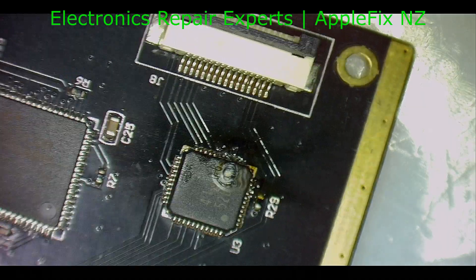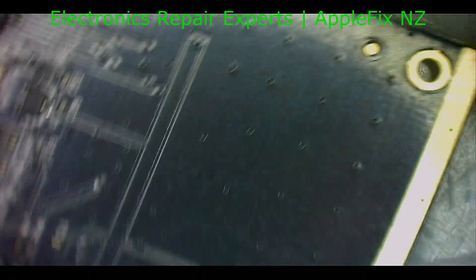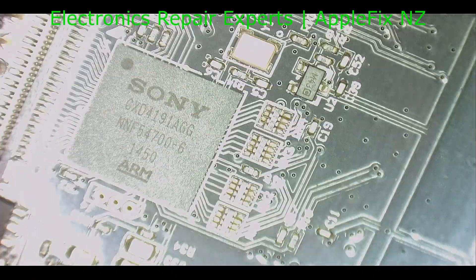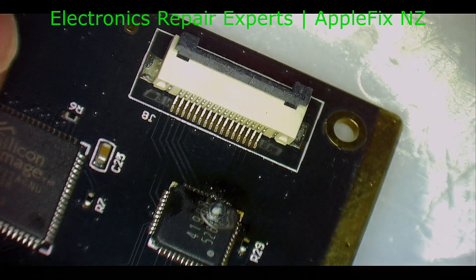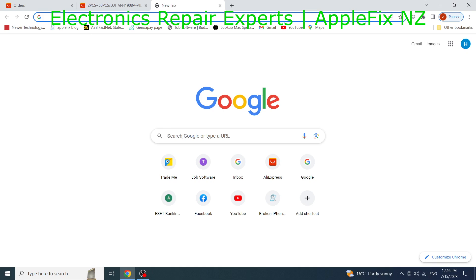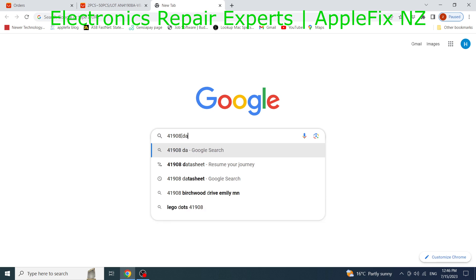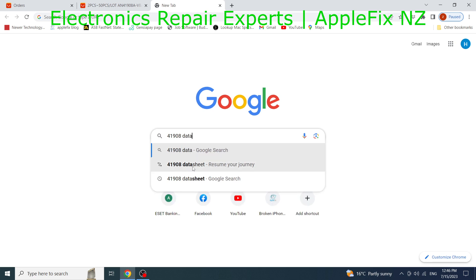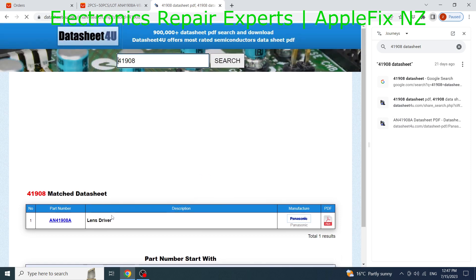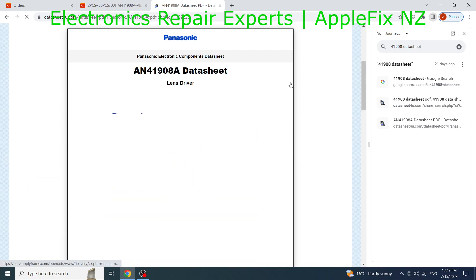The part number is 41908. Let's look at what else we have. We've got this Sony chip here — that looks all good. So let's first look up what this part is: 41908.